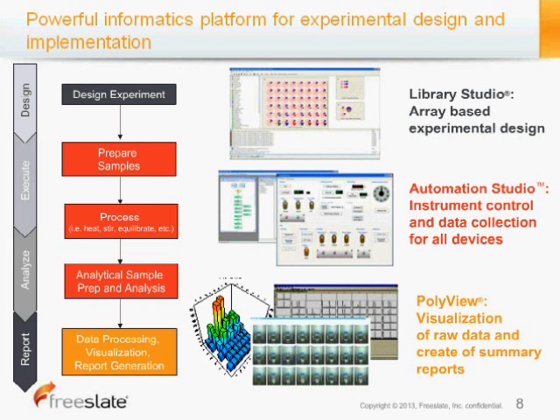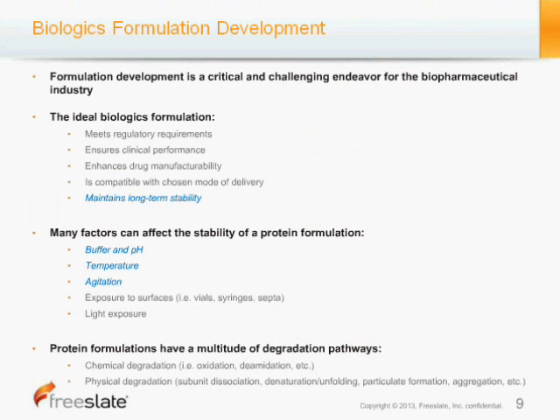Okay, so specifically the study that I'm talking about today has implications for biological formulation development. And formulation development is a critical and challenging endeavor for the biopharmaceutical industry. Now, the ideal biologics formulation must meet several requirements, including regulatory requirements. It needs to ensure clinical performance. It needs to enhance drug manufacturability. It also needs to be compatible with the chosen mode of delivery and closure system.